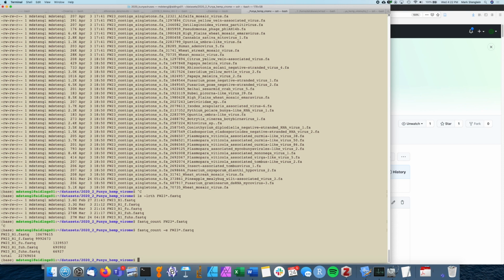Fastq count -e just estimates the number, so it gives you a pretty close value, and it goes a lot faster than counting them one by one. So the fw23_r1.fsq file was 3.6 gigabytes of data, and that corresponded to 10,679,615 sequences. A pretty good sized data set there. That's a lot of reads for something like this, so that should be plenty.